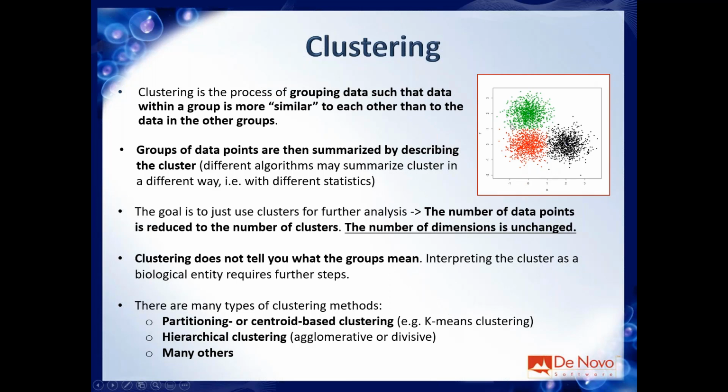So based on my knowledge, I can say that this is single positive for y. But you can do this only because you are looking at your plots. And if you have 20 dimensions, you will still have to go through multiple plots. So regarding the problem of a higher number of dimensions, clustering is not intended to solve that issue.